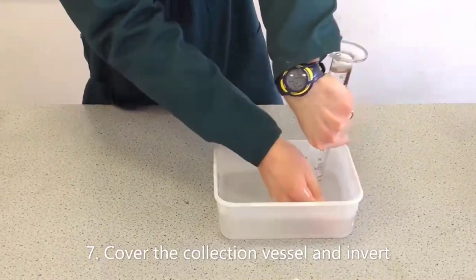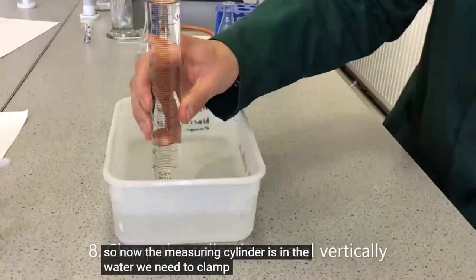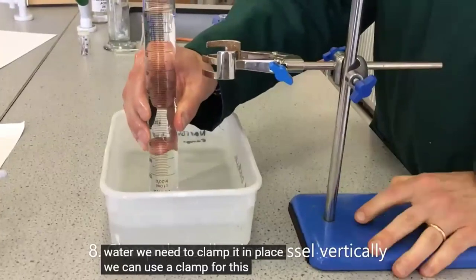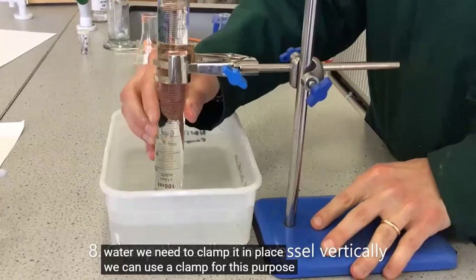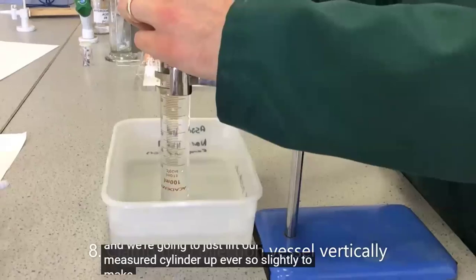Now it contains water and a little bit of air is also there. But usually when we do it, we try that there should be no air in it. Only the gas which is produced will be collected. Then you can tie it by using this clamp and a stand.